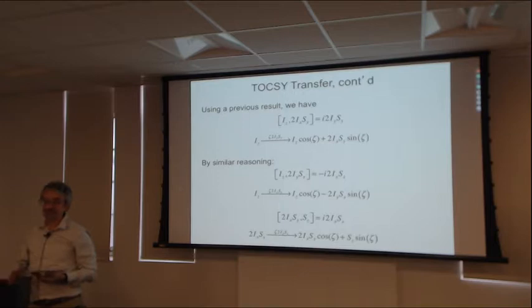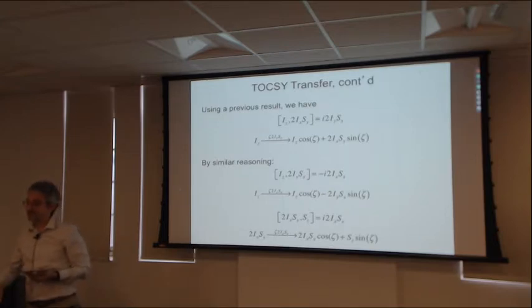Because once the chemical shifts start to evolve enough that the two spins start to develop a significant phase relationship between the magnetization components, then we're in the weak coupling limit. So if this is to work, we would have to apply a string of 180-degree pulses where the delays are short compared to the chemical shift difference.